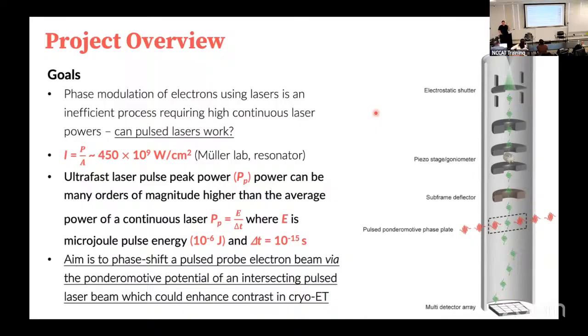So it's just difficult. Also, when you put in a physical piece of carbon, you're also attenuating the beam, so you are starting to lose signal. And so the advantage of this laser approach is that it's in free space. So you really are just interacting a stream of photons with an electron beam. So the electron beam's coming down, you're hitting it with a series of photons from the side, and then you're having an interaction between the two beams, and that is causing a phase shift.